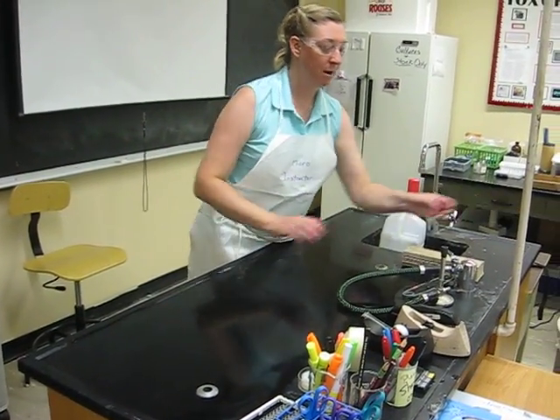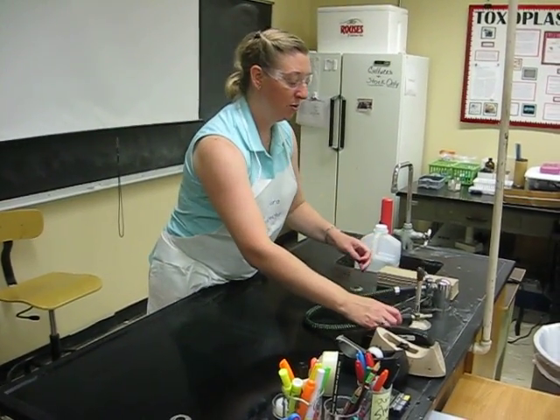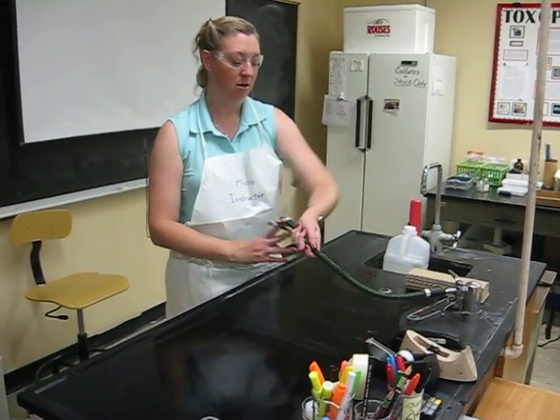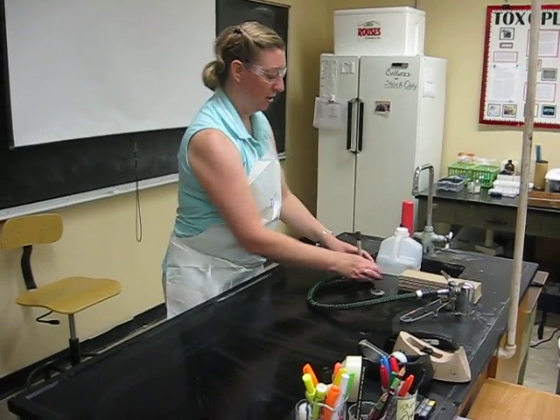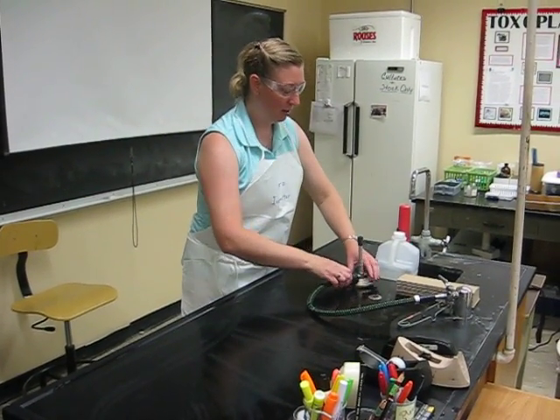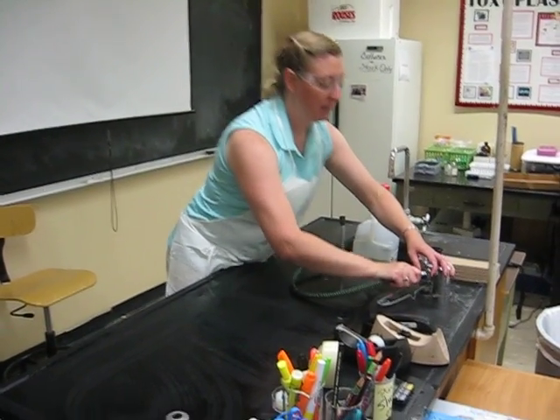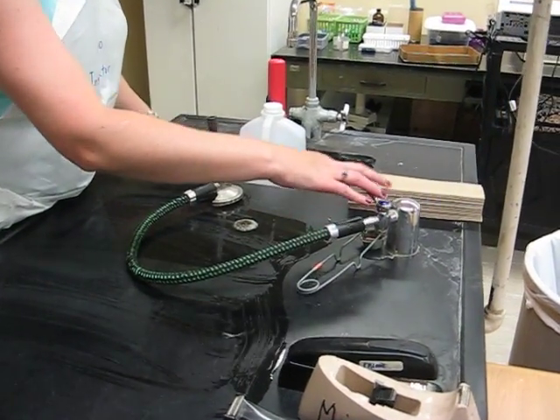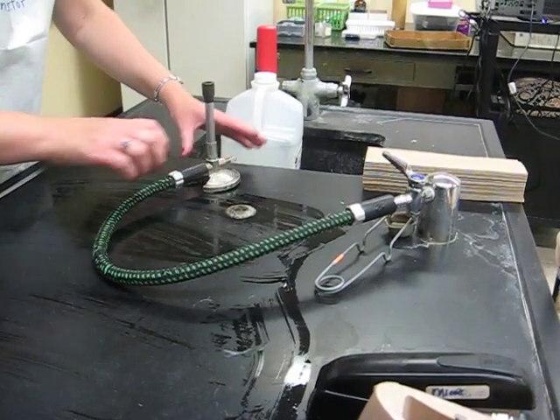While that's drying, I'm going to get my Bunsen burner and attach the hose. I'm going to put this one around — I like it on this side. Just twist it so it lays flat. Make sure it's as tight as you can get it on the nozzle. This one is perpendicular — it's off, as you can see. I'll get it as flat as I can.